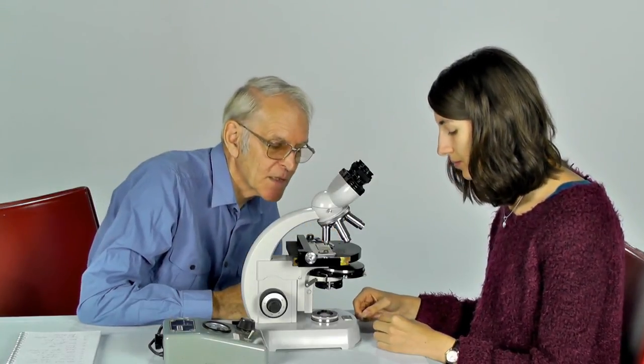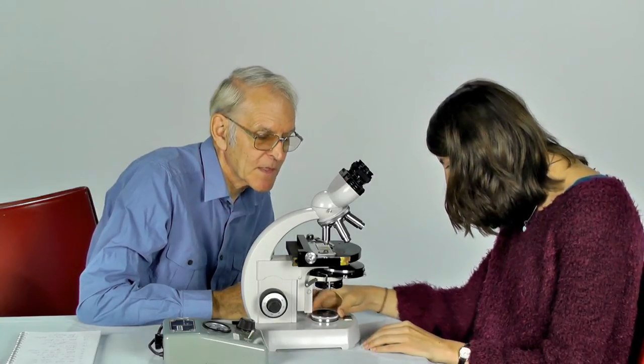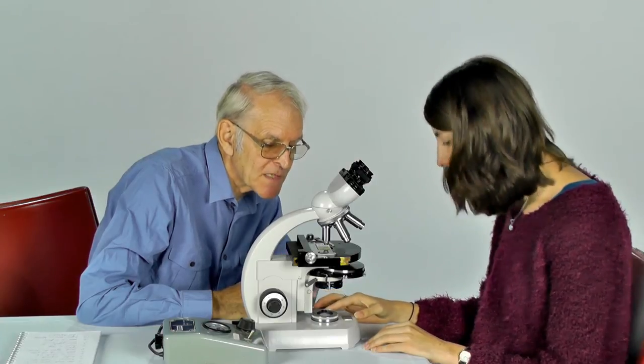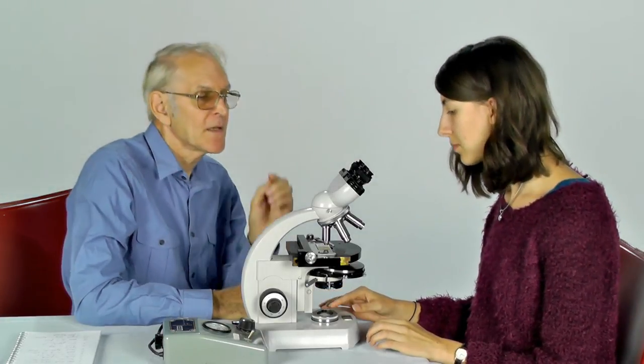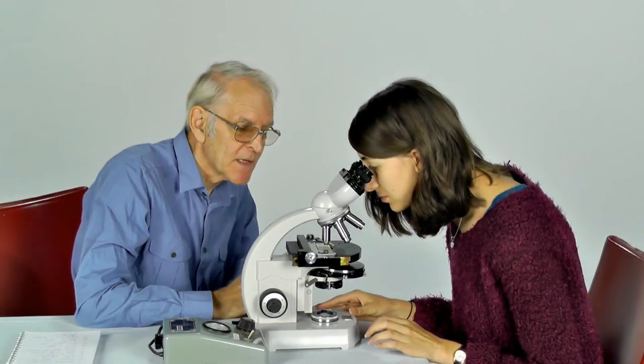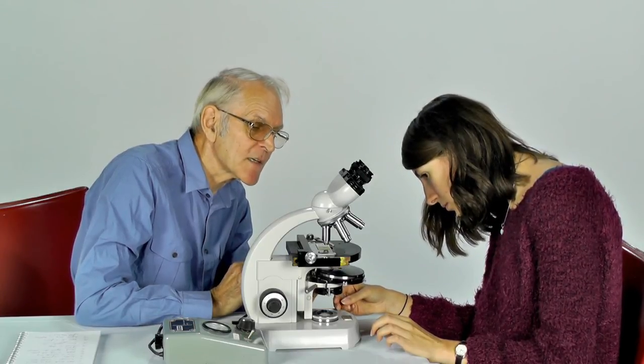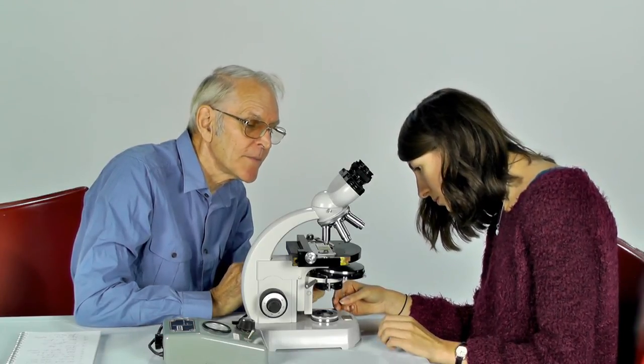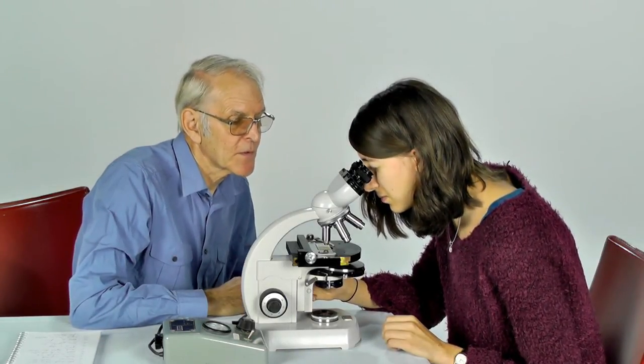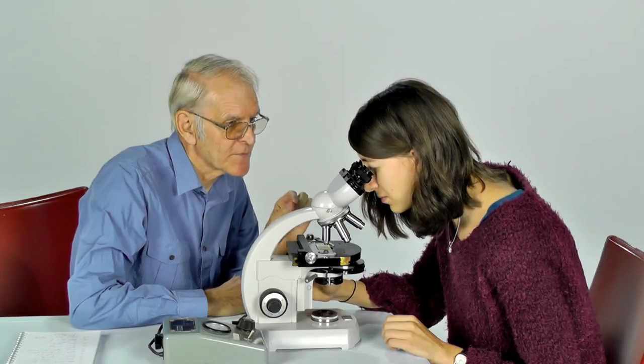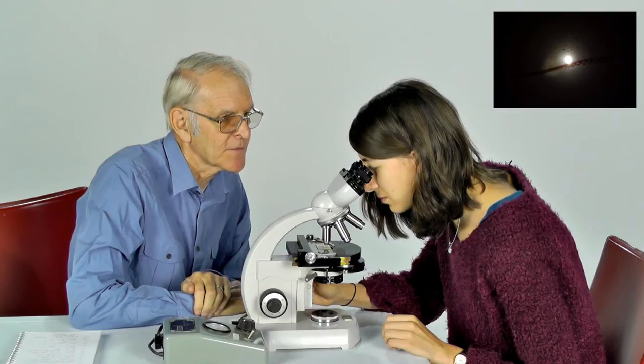Now in order to do that, we close down this iris diaphragm as much as we can so there's a very small gap for the light to come through at the base. Now you're going to look through the eyepieces and use this knob to move the condenser up and down until you can see a small patch of light with very sharp edges and that should be in the centre of your field of view. Yep, I've got that. Well done.